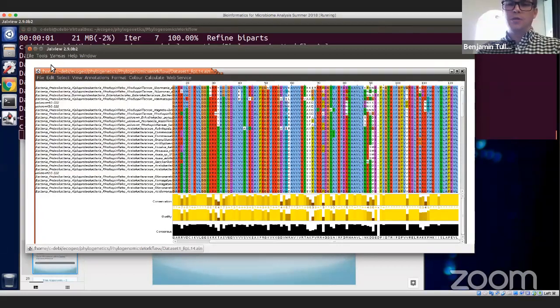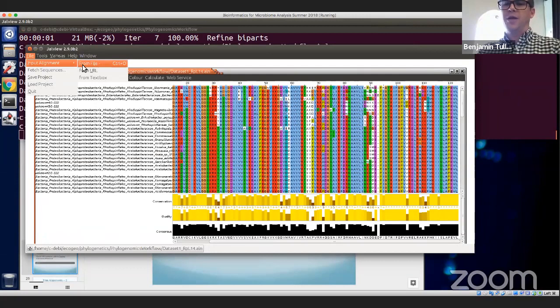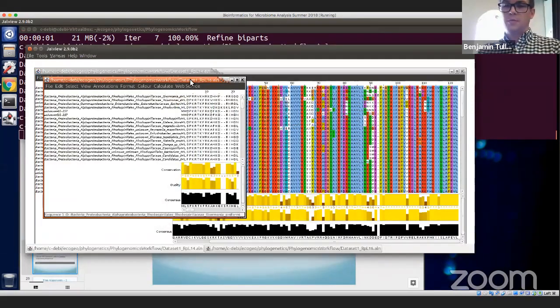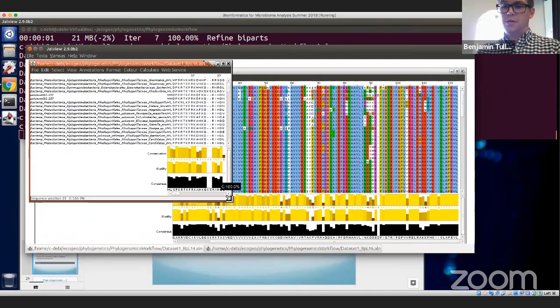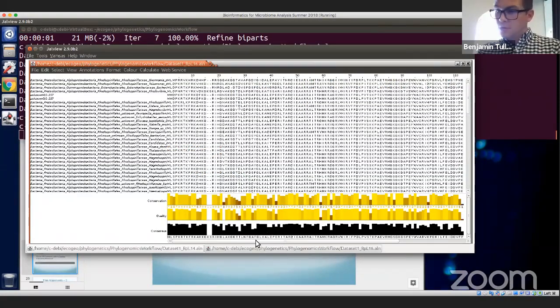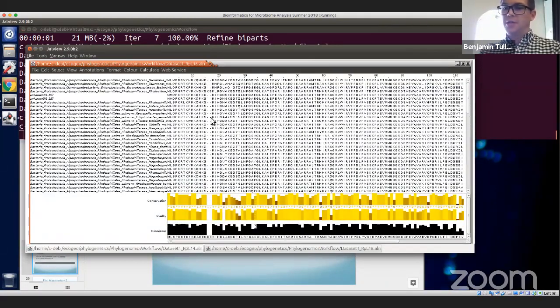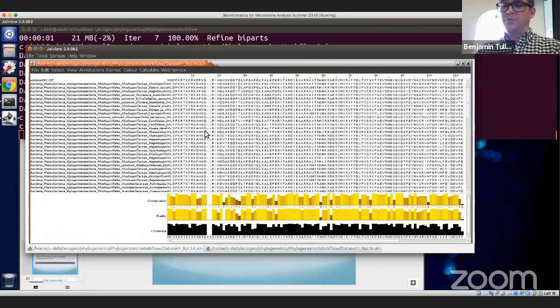We are then going to go up here, not inside that, and get another input alignment from file. In this case, we're just going to take one of these other ones, which is RPL16. We can work with that one for a second. And here's one that has quite a few more gaps. At the beginning of the sequence, it might even be the same organism, there are 2 amino acids added here, which is causing a gap to form. So we could delete that to simplify the data.